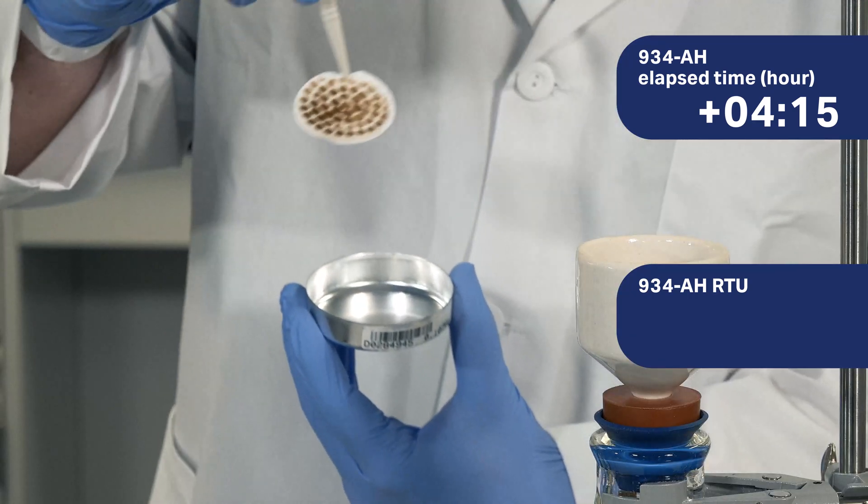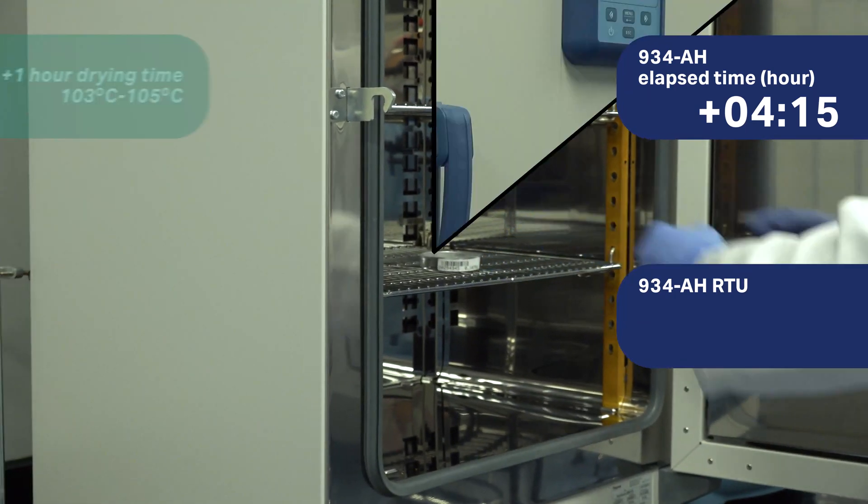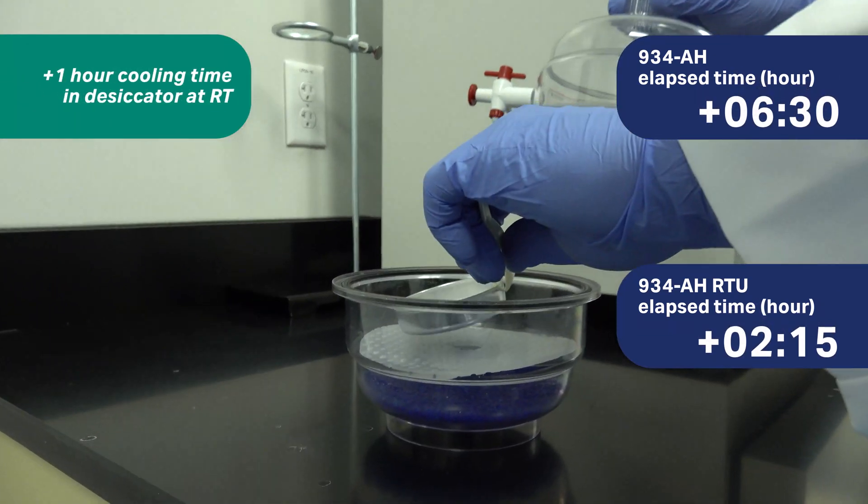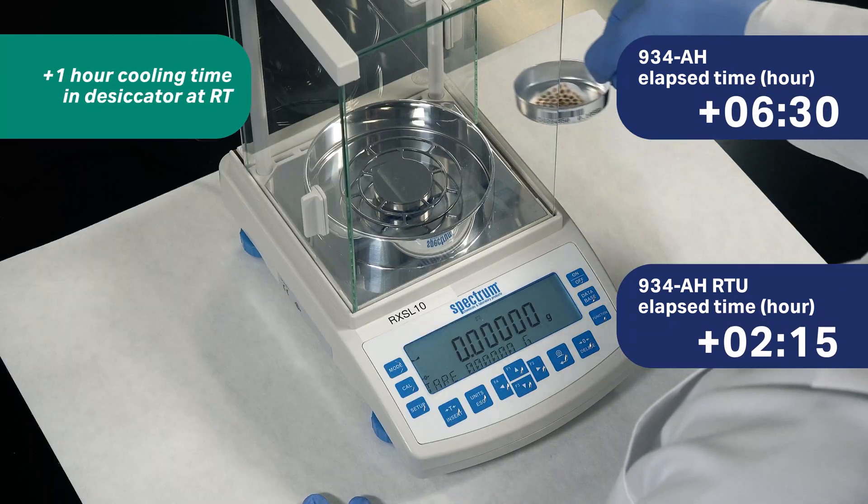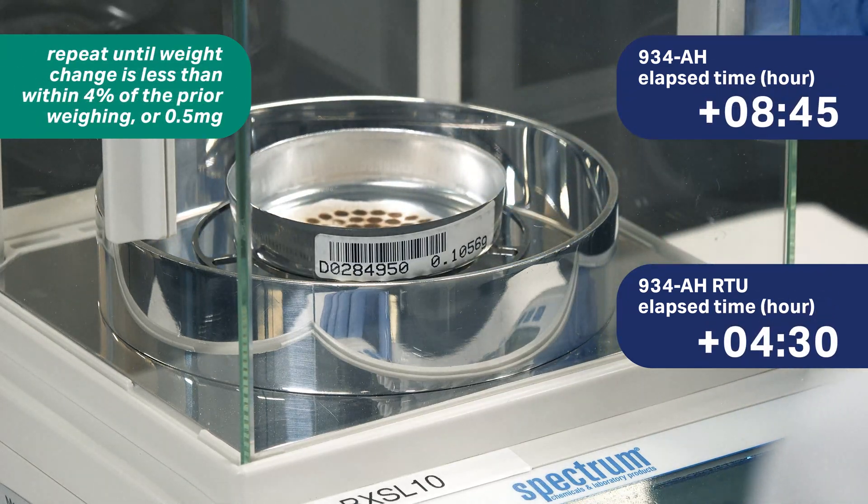Remove the filter and dry it in the laboratory oven for at least one hour. Carefully remove the filter from the oven and cool it in a desiccator. Then, weigh the filter on an analytical balance. The drying and weighing process is then repeated.